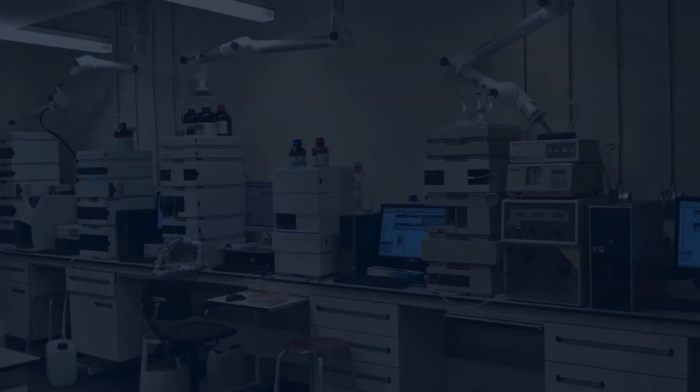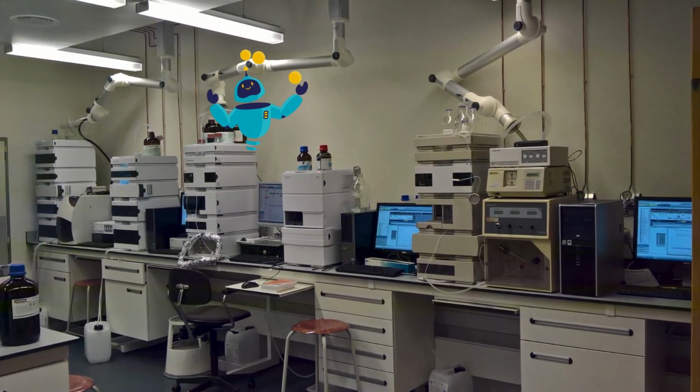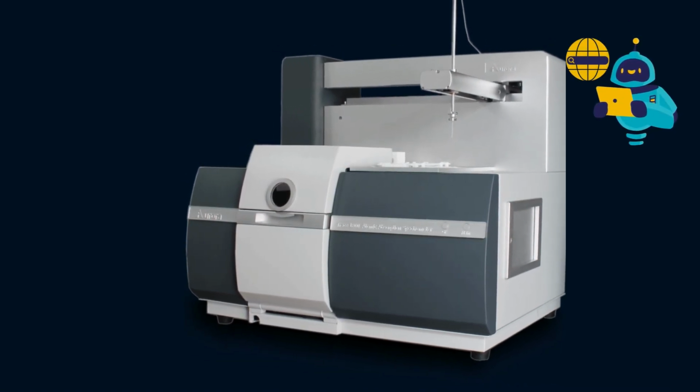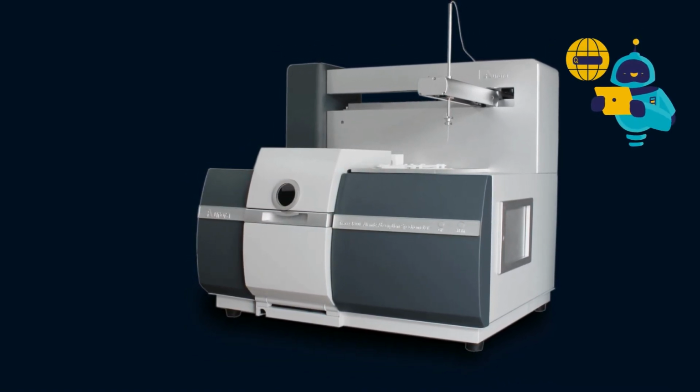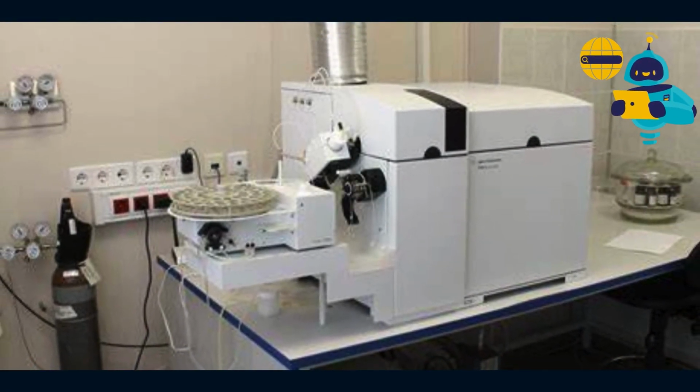Taking it up a notch, we delve into quantitative tests using sophisticated instruments. Envision scientists in a lab setting, utilizing tools like atomic absorption spectroscopy and inductively coupled plasma mass spectrometry for precise measurements, ensuring accuracy in cadmium detection.